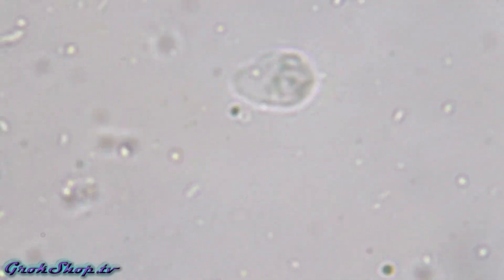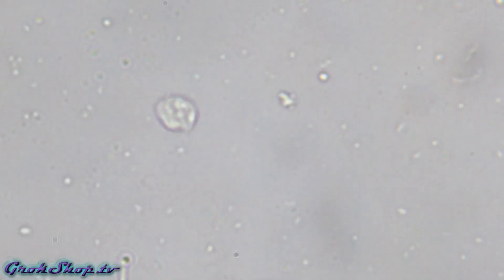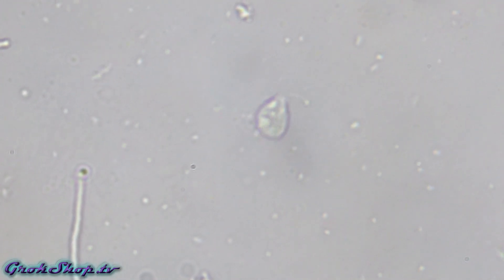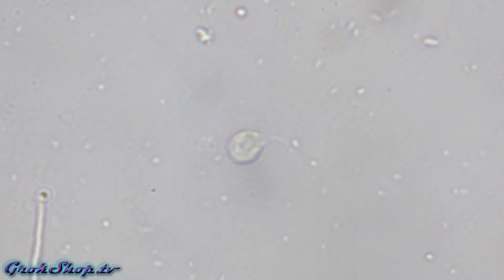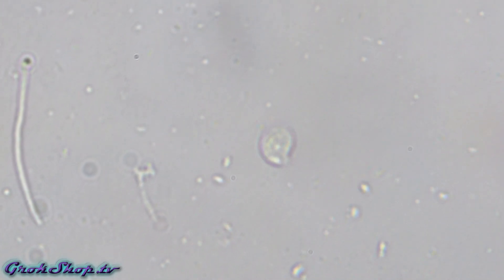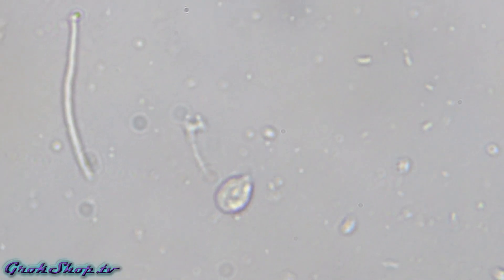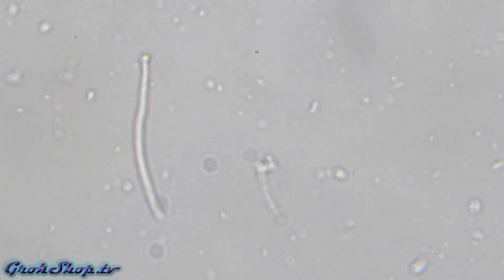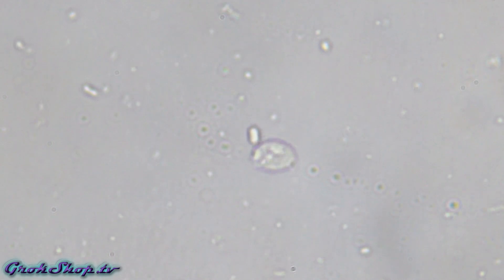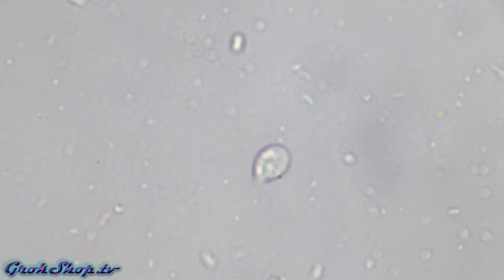Let's see where he's headed — right off the edge of the slide! And we finally see some fungal hyphae here. I've got some little flagellates here on a feeding frenzy — working one flagella in the back to move around and one flagella in the front scooping up bacteria as fast as it can. This is pretty much exactly what you want to see: a lot of flagellates feeding at breakneck pace on bacteria as fast as they can eat.